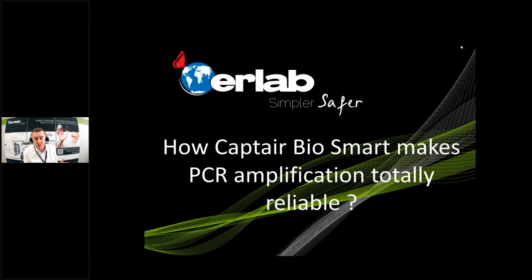So when I started to study this application 20 years ago, that's the first thing you learned about PCR. It was the case 20 years ago. Today it's a little bit more reliable, but what I learned 20 years ago is that PCR is very sensitive, and if you do not perform your application totally well, at the end you're not sure about the conclusion of your application. So that's totally amazing.